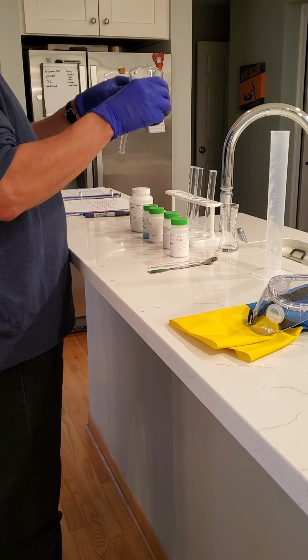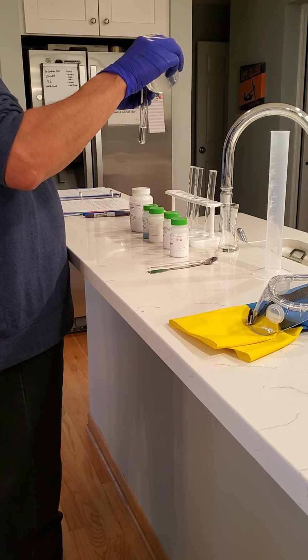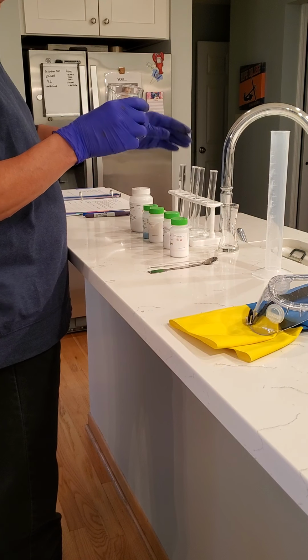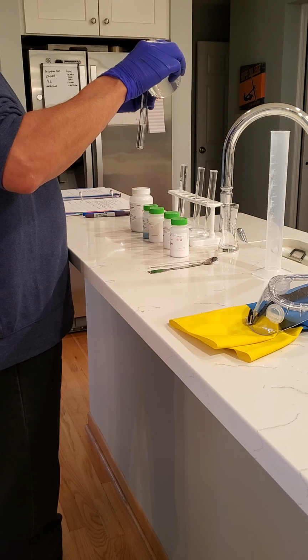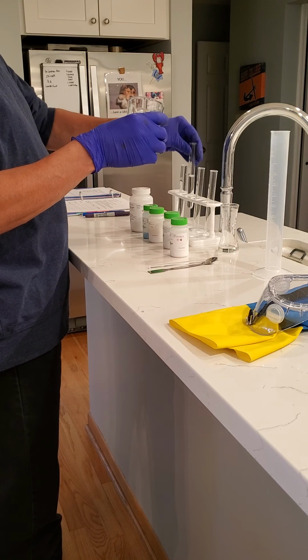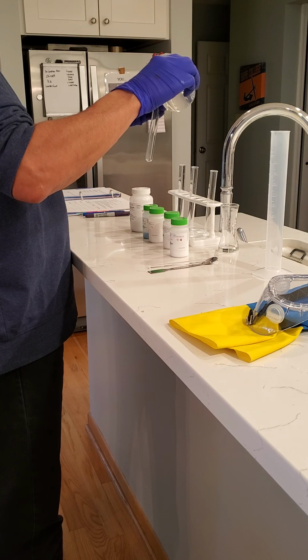Then you're going to fill the test tubes about 2/3 full with just regular tap water. You can just fill it right to the bottom of the label. And so you'll fill all 5 just with regular tap water.